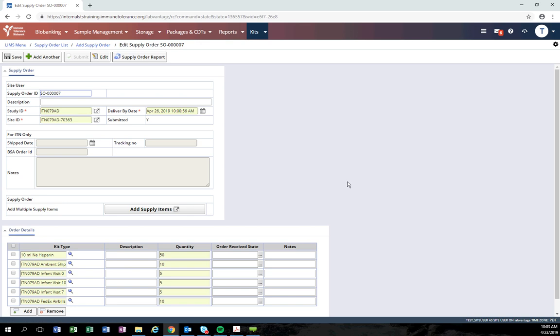After you click the submit button, if you realize you did make a mistake, you are still able to edit the order. To edit the order, click the edit button.